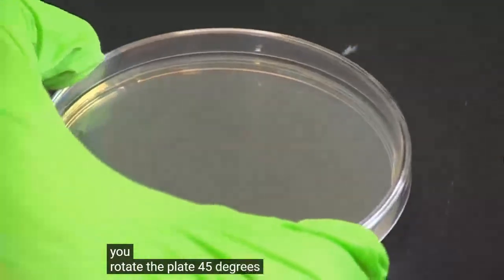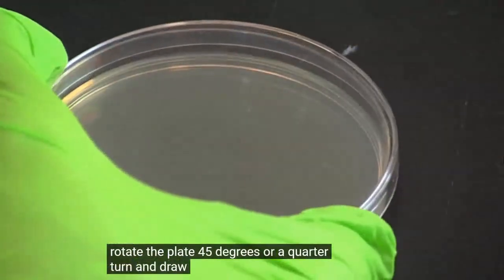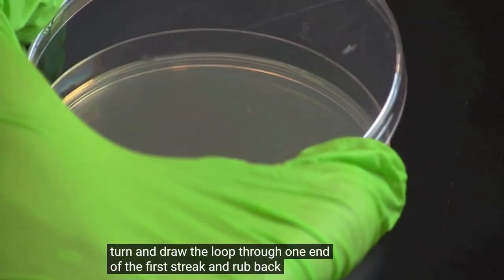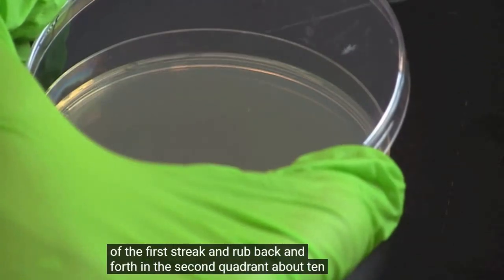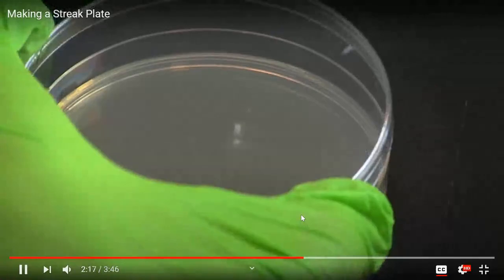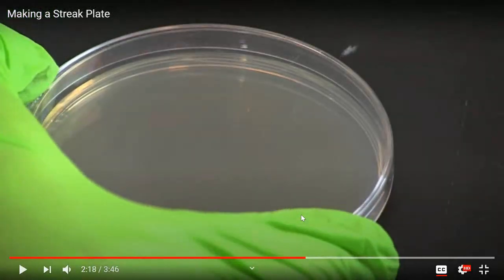Rotate the plate 45 degrees or a quarter turn and draw the loop through one end of the first streak and rub back and forth in the second quadrant about 10 times. Now you notice that what he did, he used the loop, he moved into zone 1 several times, and then he stayed out of zone 1 and spread the bacteria into zone 2.